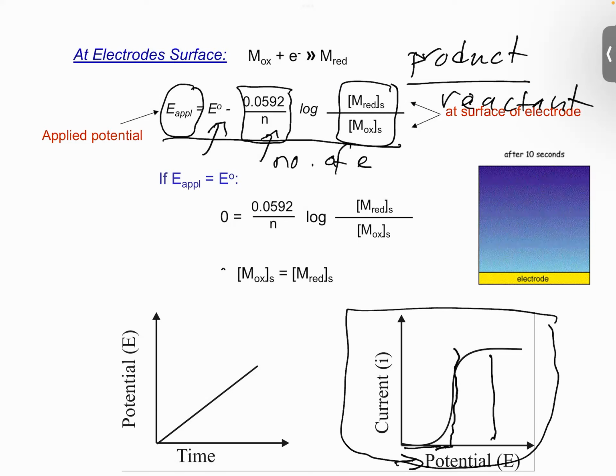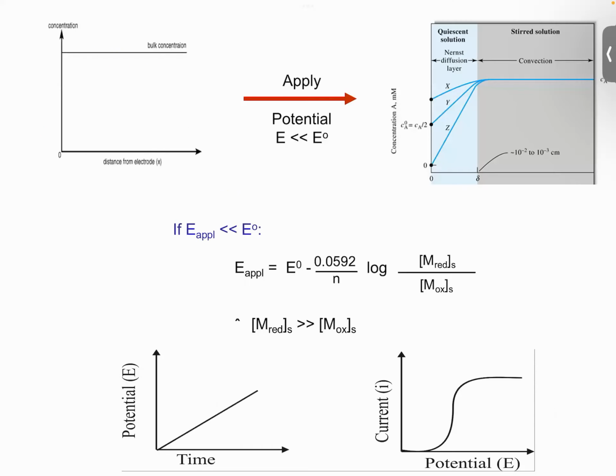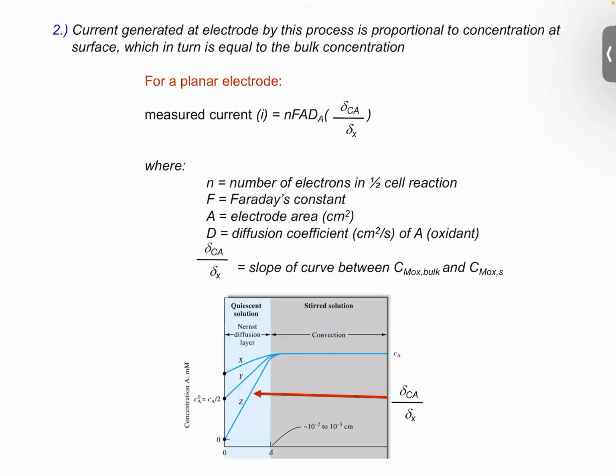And this is the maximum current, showing the maximum concentration of the metal that we measure, plumbum 2+, that we have inside the sample. So you can identify. All right, let me.